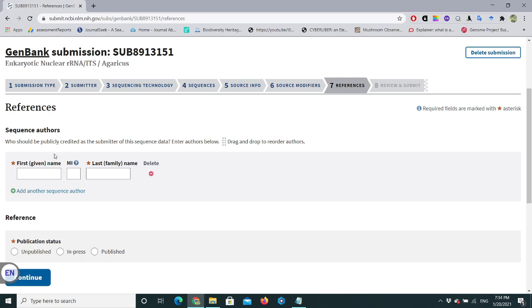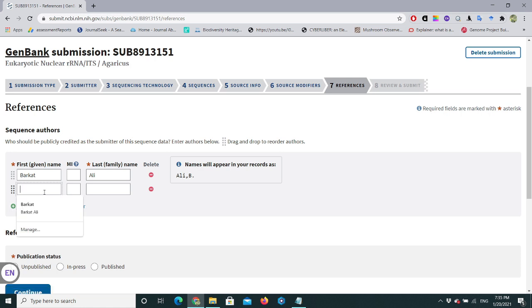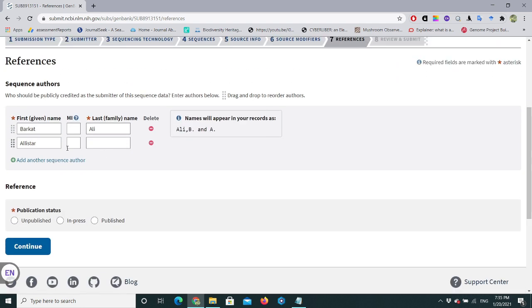In the References section, who should be publicly credited as the submitter of the sequence data? I generated these sequences and I'm working on these organisms, so I'll put my name — last name: Ali. If you have collaborators, you can add them too — for example, I'm adding a second colleague, Alistair. Add each person one by one.